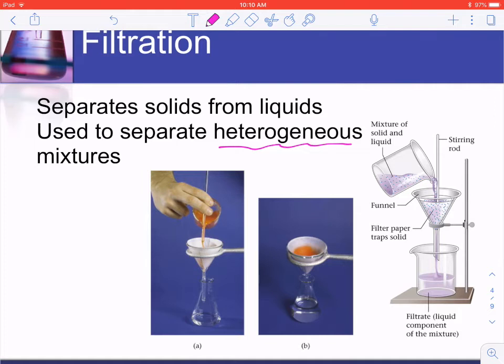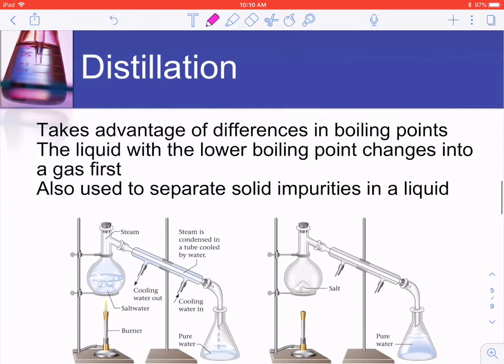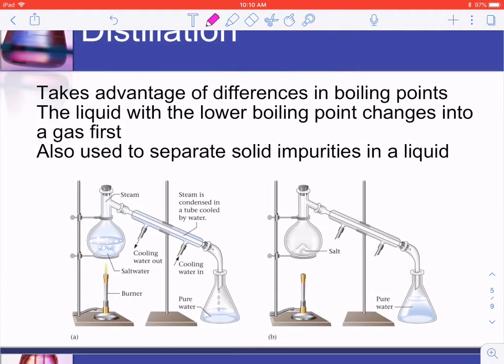You pour a liquid through, and the liquid's going to carry some of that caffeine and what we know and love as coffee into the bottom. This is similar, although we're not carrying liquid through. We're trying to separate the liquid from the big particles. And so you'll notice over here on the right-hand side, if we pour that through this funnel with filter paper, the solids are left up here on top while the liquid drains through into the flask below, and we've separated them.